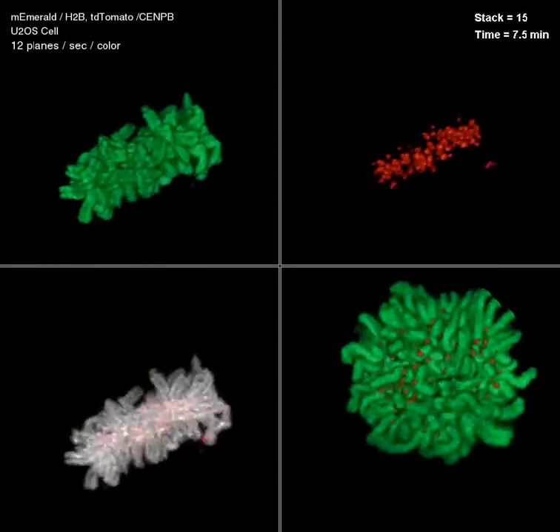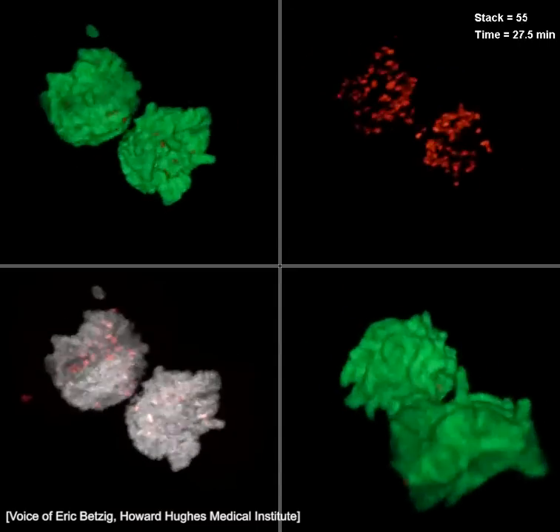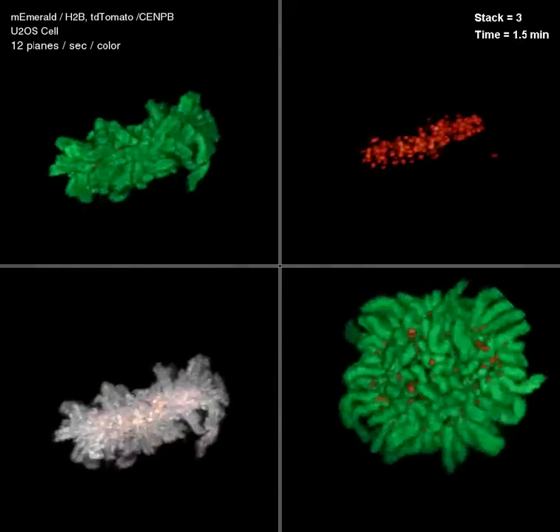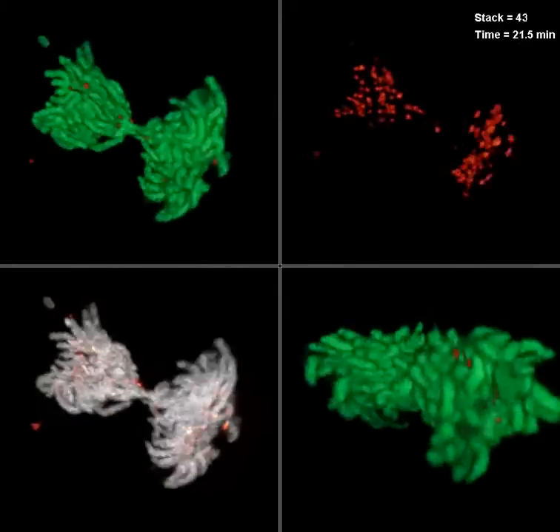What you're seeing is a human osteosarcoma cell which is exhibiting massive polyploidy. So there's more chromosomes than normal in a human cell.